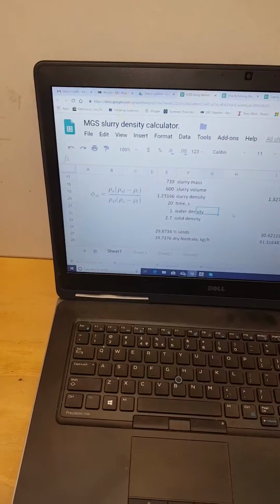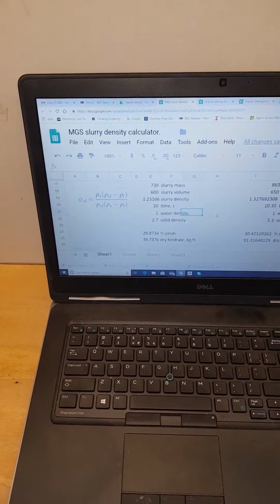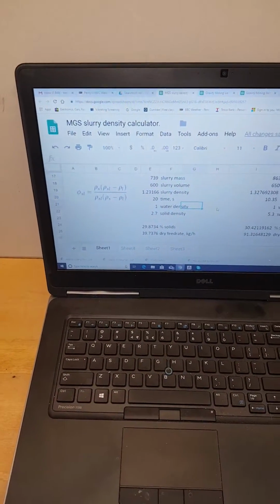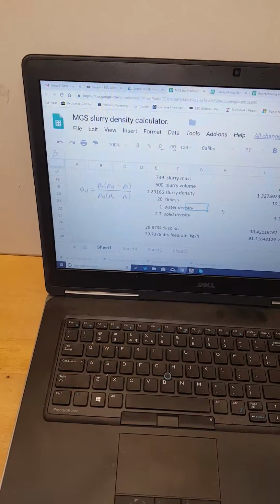Because it's tin, we more or less know where the settings are going to be, and we'll just run with those and take one sample, one test, and that'll be that. So hope that made sense.